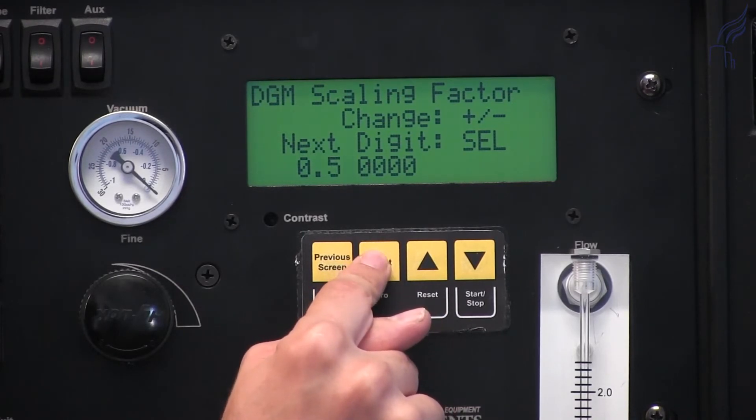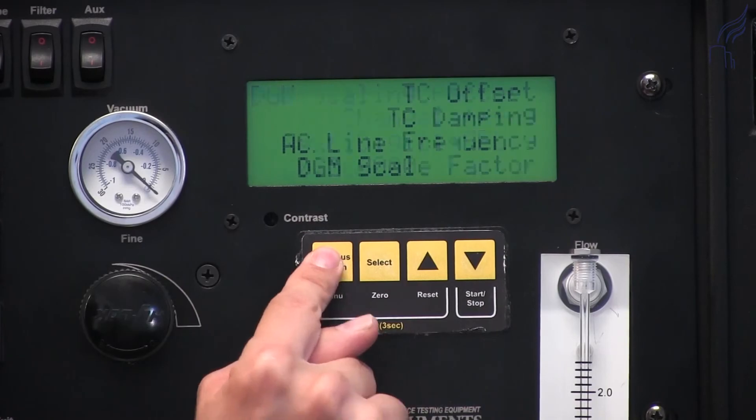Once you're happy with this value, you can press the previous screen button to go back.